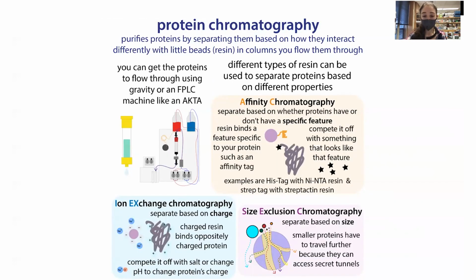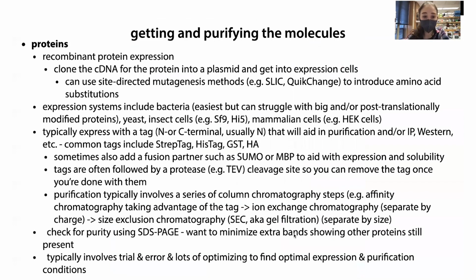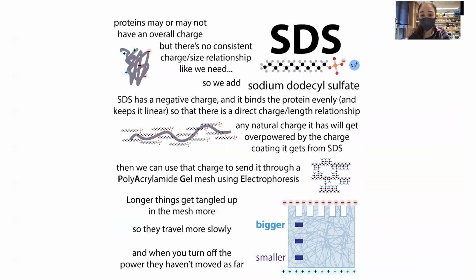And therefore they'll travel faster, and you'll end up separating the proteins based on their size. So in these ways, you can purify the proteins. You can check for how pure they are along the way using SDS-PAGE.